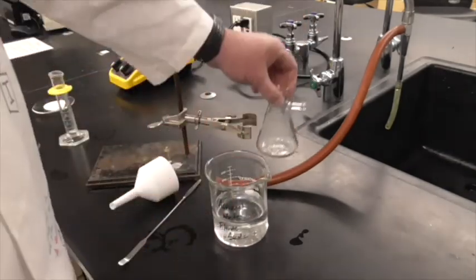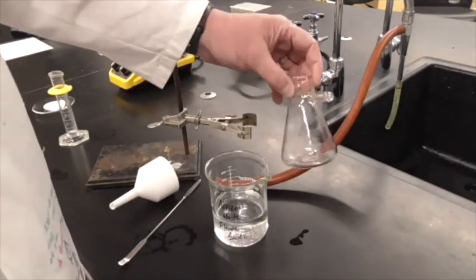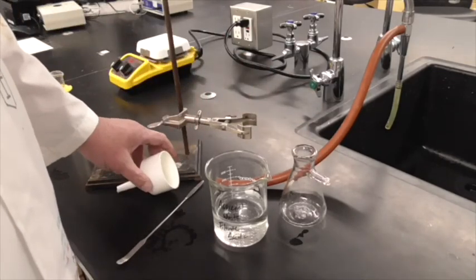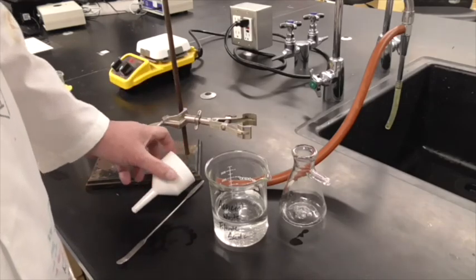Okay. So now what we'll do is we'll rinse out our flask and our filter funnel, make sure they're all clean, and we'll be done until we have to weigh our sample tomorrow.